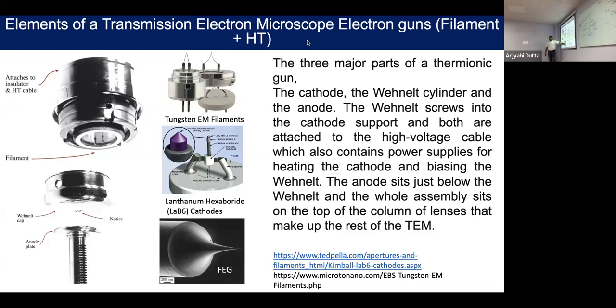Now this is the field emission gun. The field emission gun, generally what I showed you previously, that Schottky field emission gun, they are using the same tungsten type of filament, but they are coating with another chemical that is called zirconium oxide, and they are decreasing the work function drastically, which is helping to work at a very low, not very low temperature. For this tungsten filament, if you have to heat to 3000, in this kind of filament, you have to just heat to 1400, and it will be easy to remove electron.